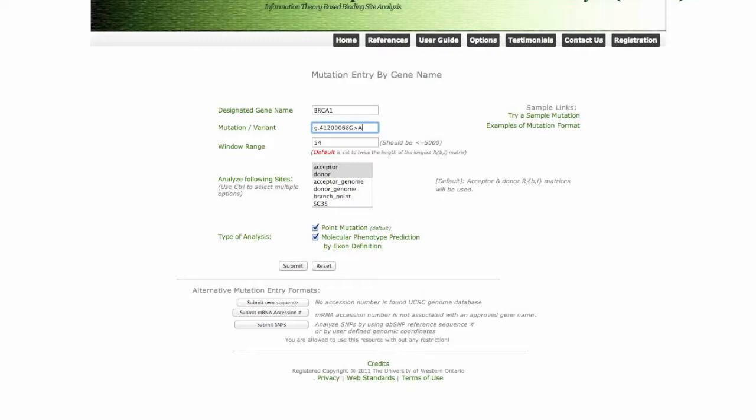This website, ASSEDA, is based on a previous version called ASSA, with the previous splice.uwo.ca, which used to be HG18. Now the coordinates have been updated to HG19, as have all the databases for RSIDs and gene names and coordinates. You can also put in other HGVS notation variants, such as IVS notation. This should be the exact same mutation. You can also do cDNA. And they do not have to be point mutations. You can also put in deletions and insertions.